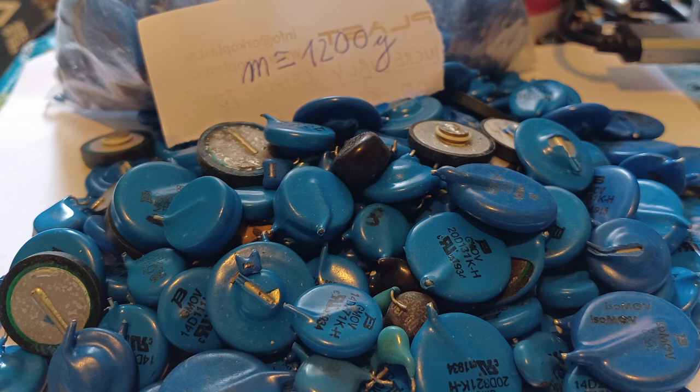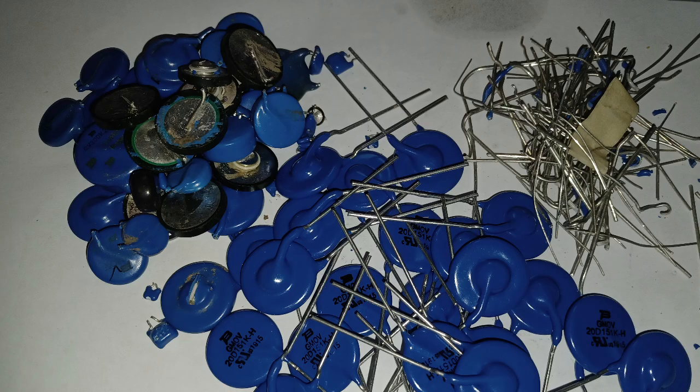Hello there. Today I'll be finding out the silver content of some ground metal oxide varistors. I got good results from similar kind of material in the past, so I decided to process all of them I have in one go.